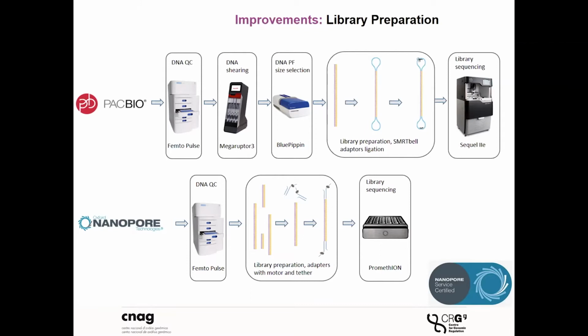Because unlike short read sequencing as in Illumina, where you can keep the library frozen for years, this is not really recommended for long read libraries, not only because of breaking the long strands, but as well, there are proteins there. So these will really not like the storage and the freezing and defreezing.